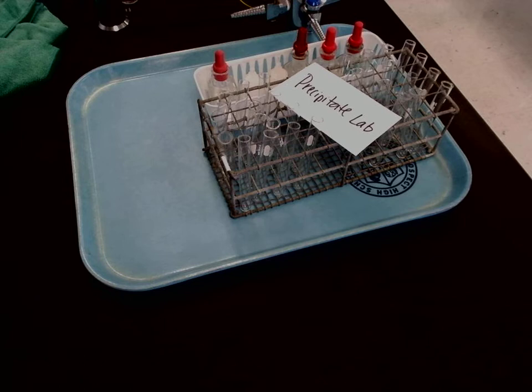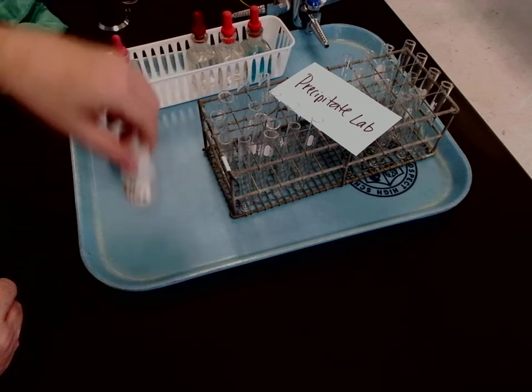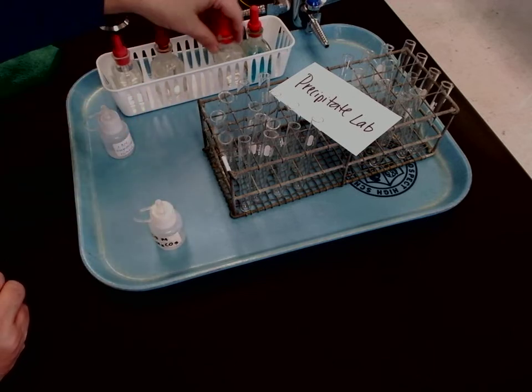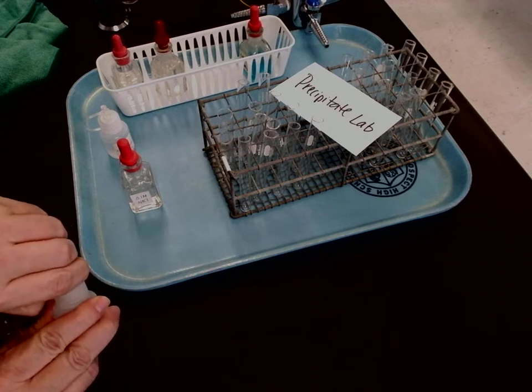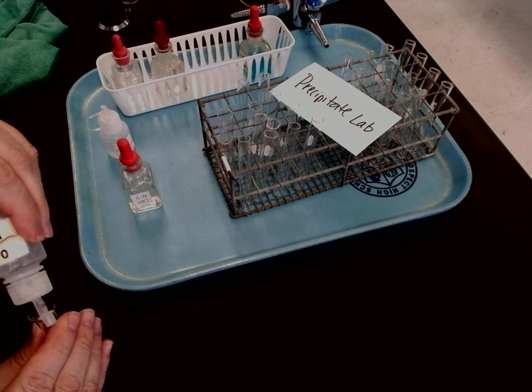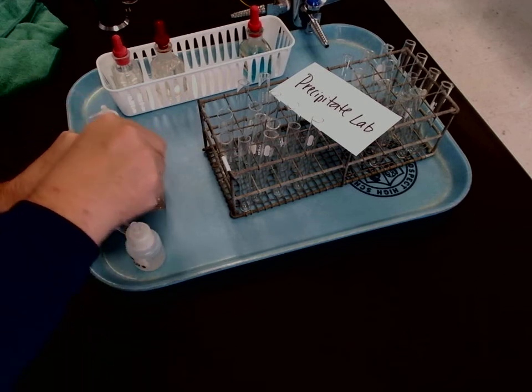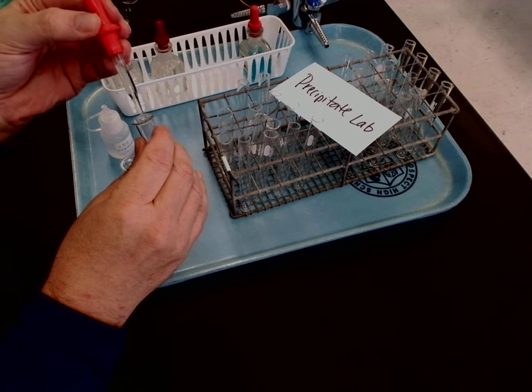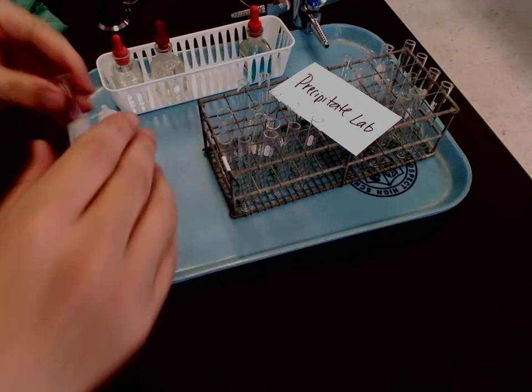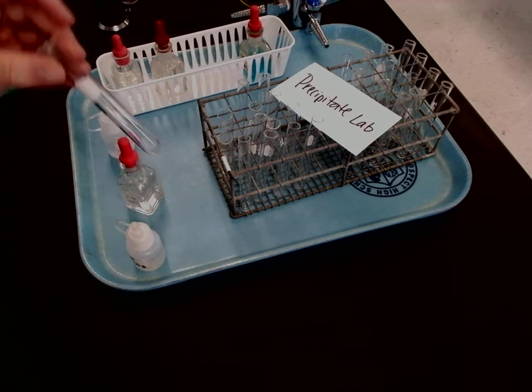The first one we're going to be looking at is mixing sodium chloride with sodium carbonate. So there's the sodium carbonate and here's the sodium chloride — I'm going to mix those together, just putting a couple drops in each test tube. All right, and there we go — no precipitate showing up in there. That's the first one.